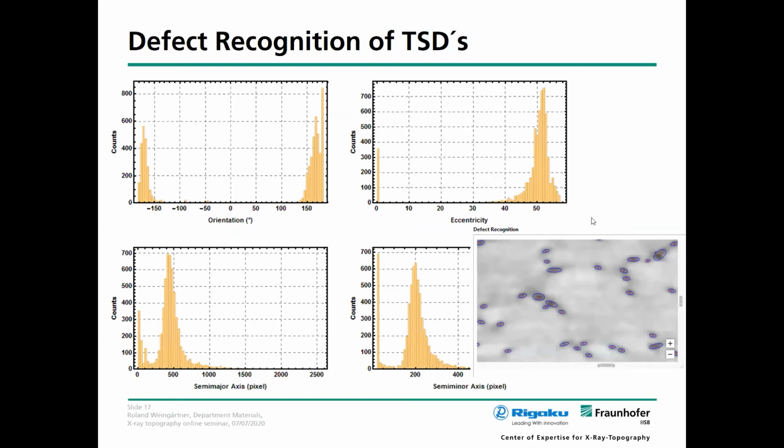Okay, I just want to make some small comments on the reliability of this method. Of course, it depends on defect recognition, which you can see here. So you can automatize that these defects are recognized.